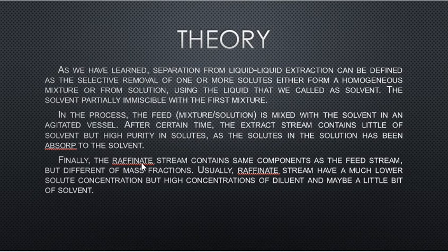Finally, the raffinate stream contains the same components as the feed stream, but with a different mass fraction or composition. Usually the raffinate stream has a much lower solute concentration, but a high concentration of diluent and maybe a little bit of solvent.